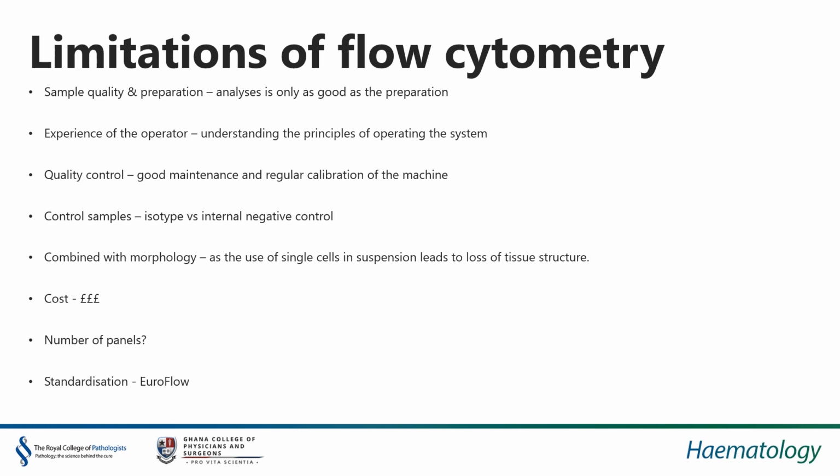Sample quality and preparation. The analysis will only ever be as good as the preparation. We know that with malignancies, not just in acute leukemias, but in all hematological malignancies, if you've got a very poor pull of the sample, or it's quite a fibrotic sample, or if you've got a case where the sample is quite clotted, it may not give you an accurate representation of what is going on.